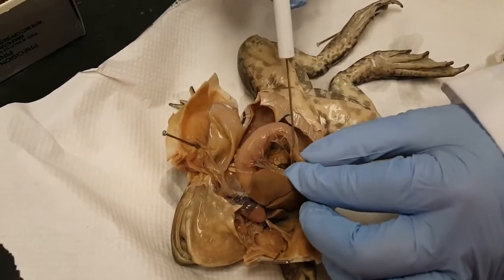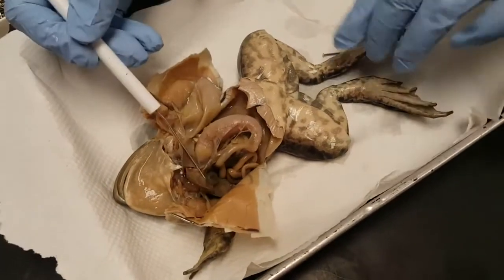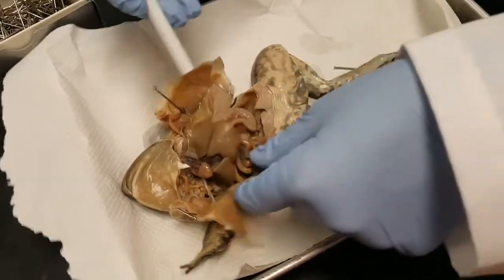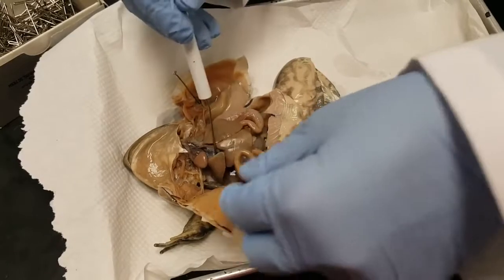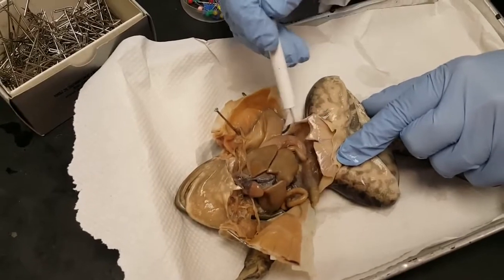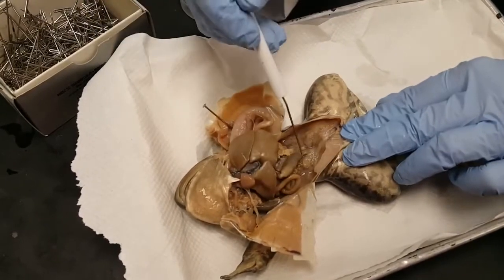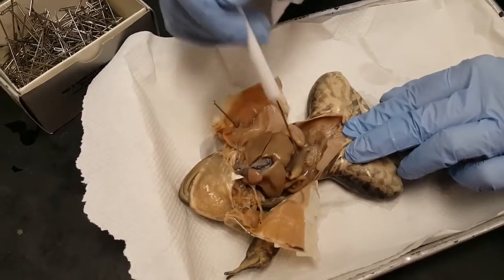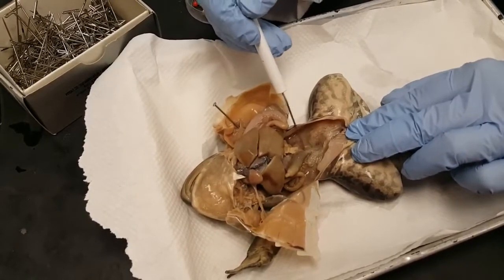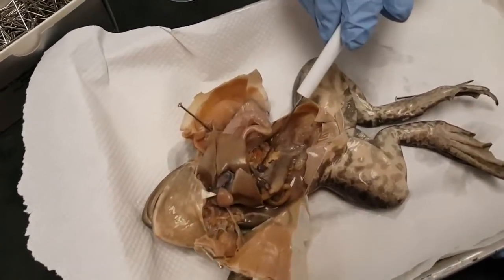At the bottom of the stomach there's a valve called the pyloric sphincter valve, and then that connects with the small intestine. The first part of the small intestine is the duodenum. Then the curly part of the small intestine is the jejunum. And then the last part going to the large intestine is the ileum. There's your large intestine. And then at the very bottom of the large intestine, food waste products and eventually sperm and urine empty into this area called the cloaca, which goes to the outside of the body. This little red organ right there is the spleen.